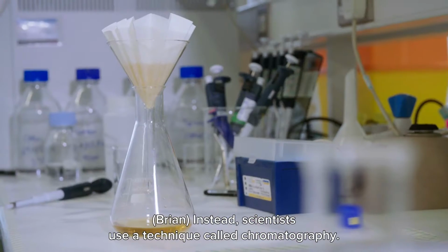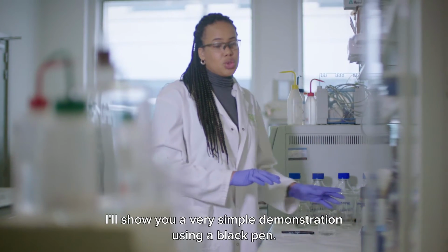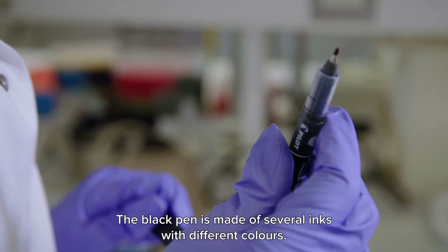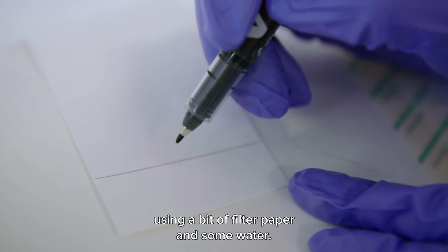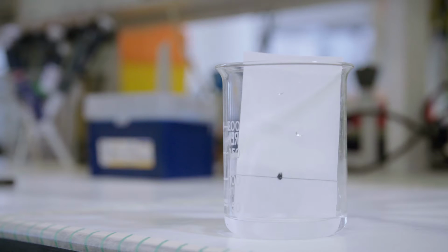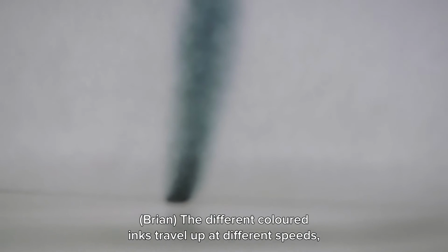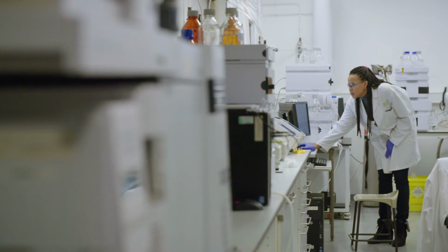Instead, scientists use a technique called chromatography. I'll show you a very simple demonstration using a black pen. The black pen is made up of several different inks with different colors. We can separate the inks using a bit of filter paper and some water. The different coloured inks travel up the paper at different speeds, depending on how much they like water. The same principle is used to separate the substances in urine.